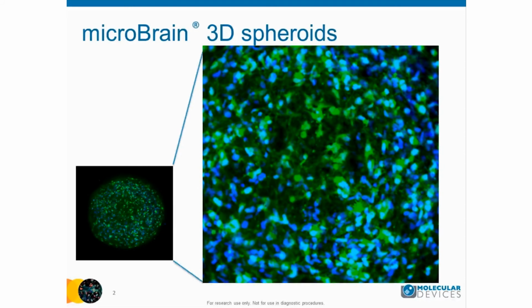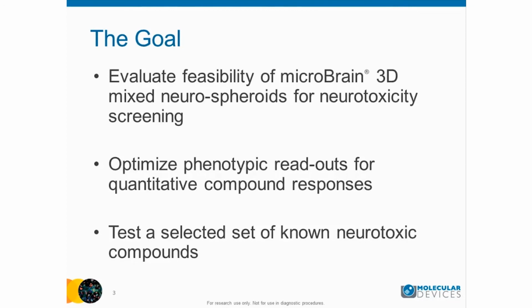So there is a pressing need for the development of multidimensional screening strategies that could provide improved predictivity and also facilitate prioritization of chemicals for in vivo testing. Also very important is the requirement for assays to be compatible with high-throughput screening.